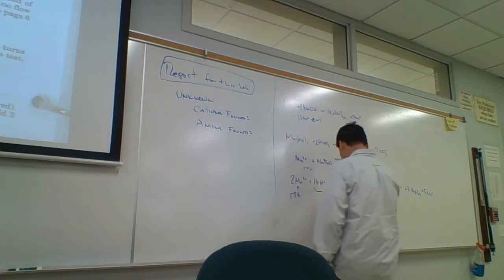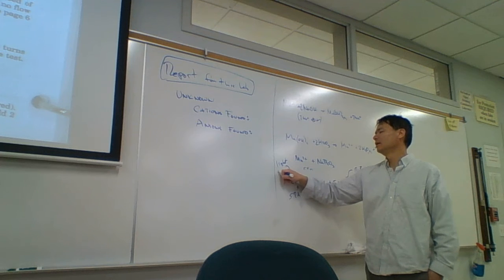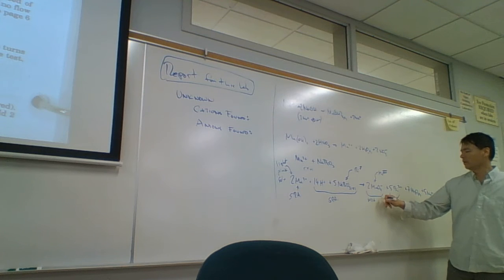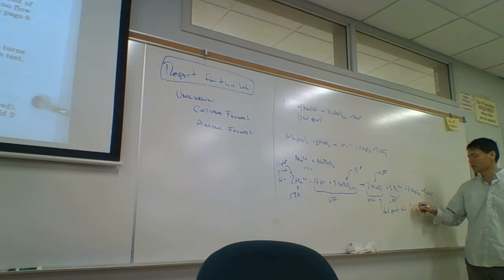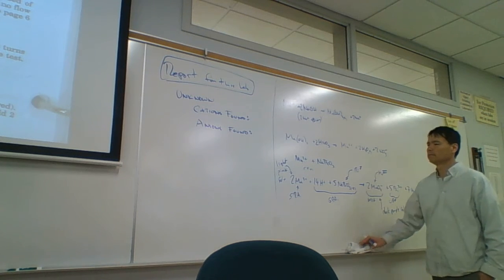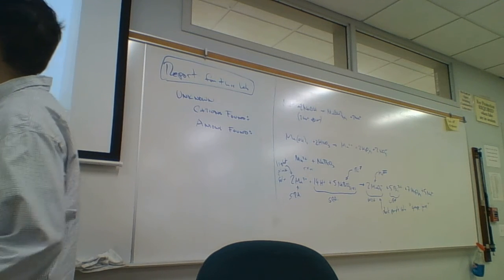In this step, what we're going to do is, this is light pink. Manganese 2 plus is a light pink solution. So we're going to go from a light pink solution to a dark purple solution. The permanganate forms a dark purple solution. Or, you know, you're just looking for something that looks like grape juice. This looks like grape juice. Not with white grapes, but with colored grapes. Okay.